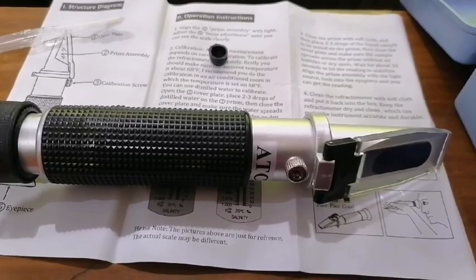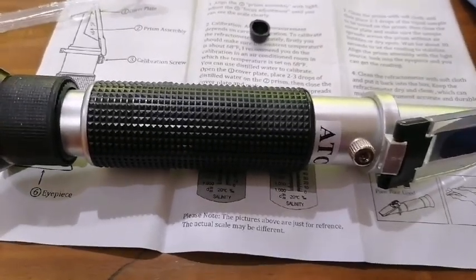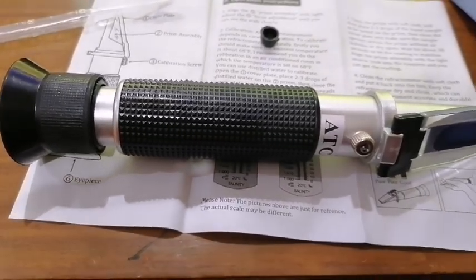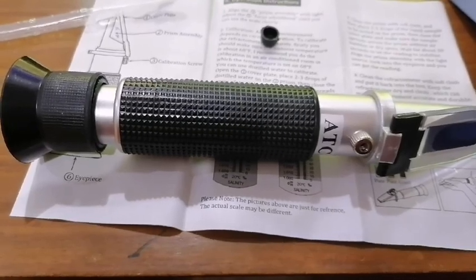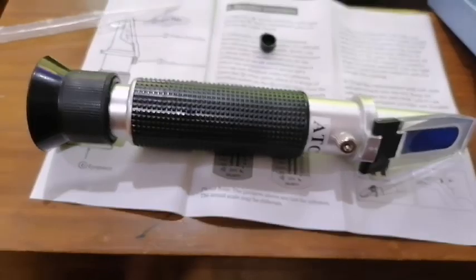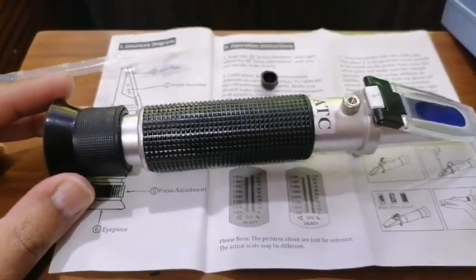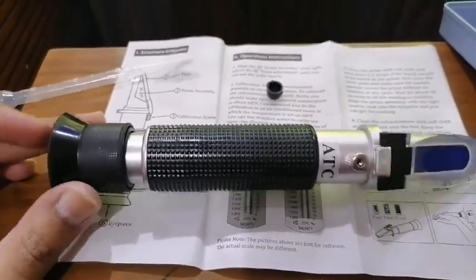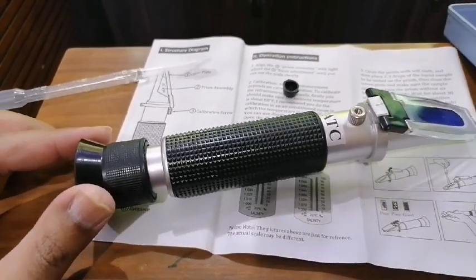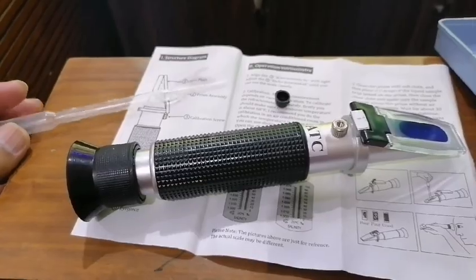After calibration, you can measure the salinity or specific gravity of the saltwater. I have already told you that the specific gravity should be between 1.022 and 1.026. The main thing is how to use it, and first you need to calibrate. I hope that you enjoyed the video. If you have any problem or want to share anything, you may comment. Take care. Thank you. Bye bye!